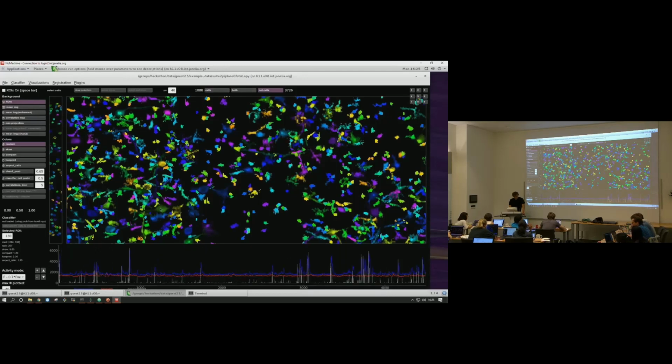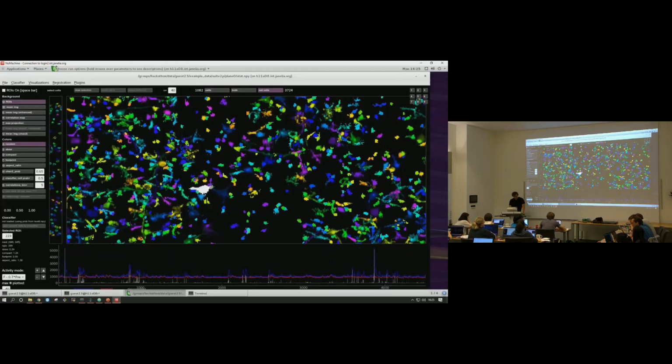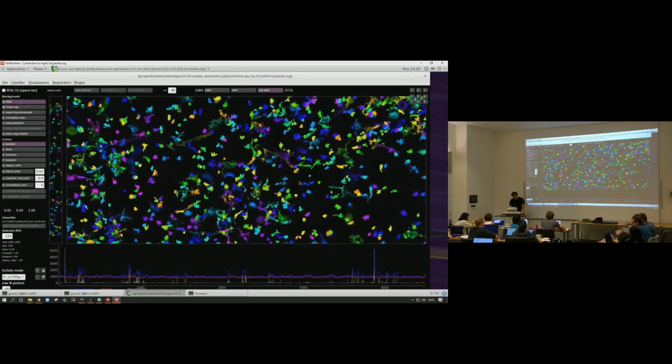Okay, I'm not going to click through all of them, just give you a sense. Of course, some of these dimmer cells that do have long processes, that actually makes us more certain that they are cells because we can see the entire anatomy of them.